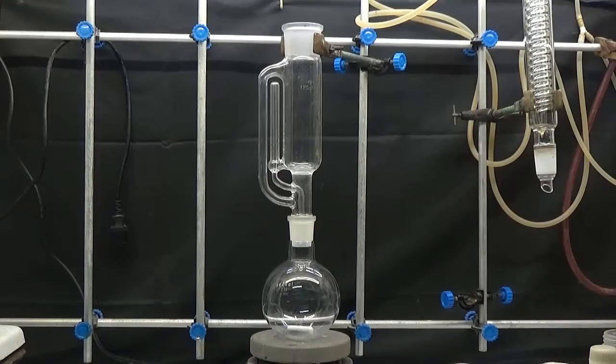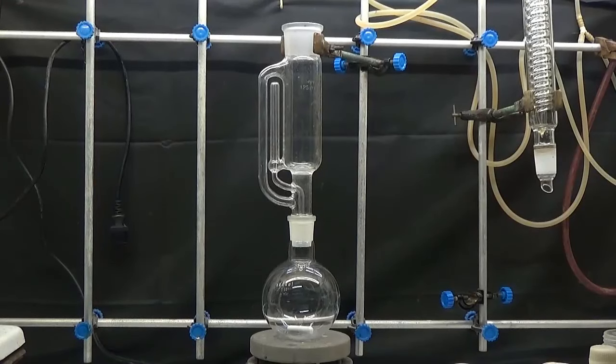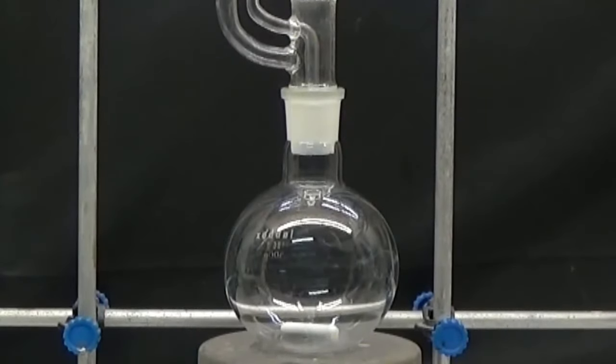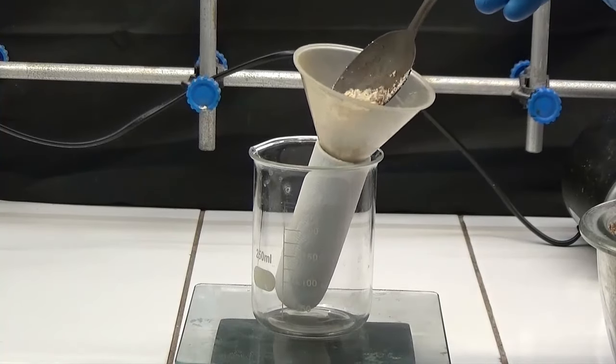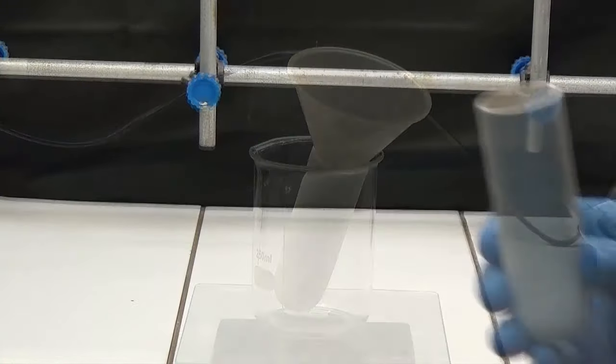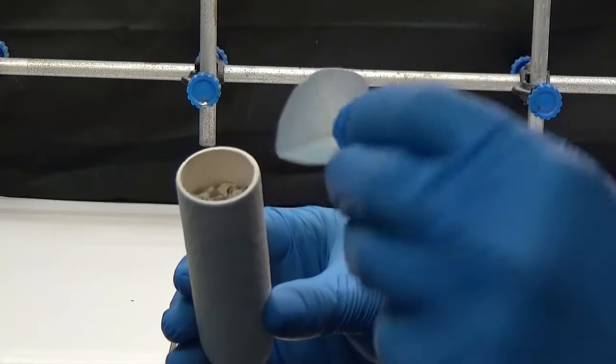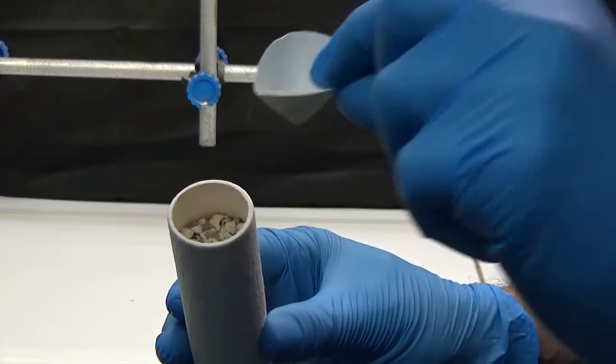We put in place a Soxhlet extractor with a 500 milliliters flask to extract all the fat from the seeds. Load the filter cartridge with 30 grams of raw material. To prevent material from being removed from the cartridge, cover with filter paper.